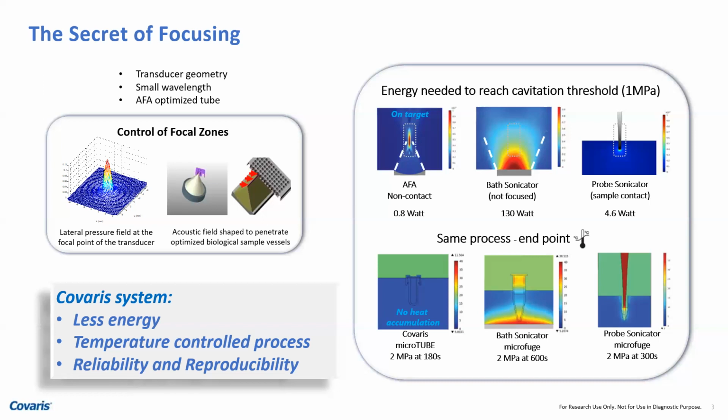What does that mean to your unstable samples? Even more so when you're working with proteins or RNA, which are not very stable. They can disintegrate. You can basically jeopardize your analytes.